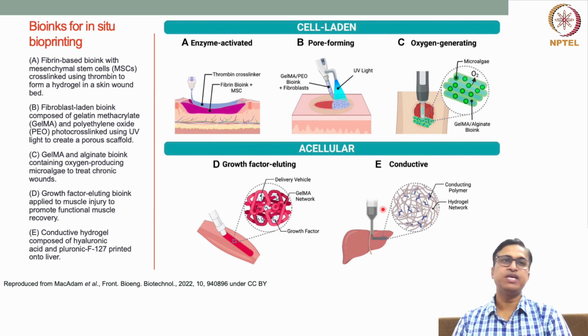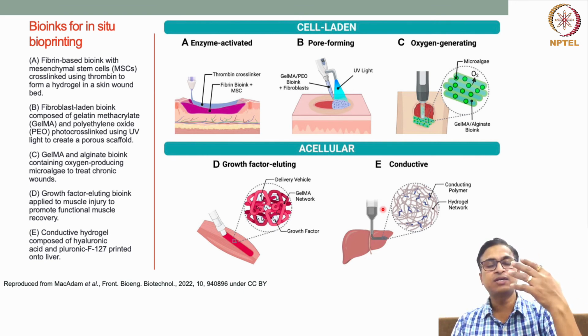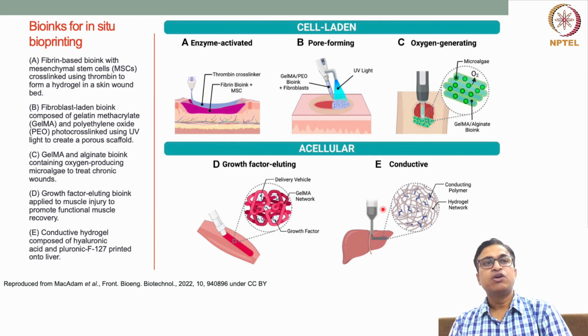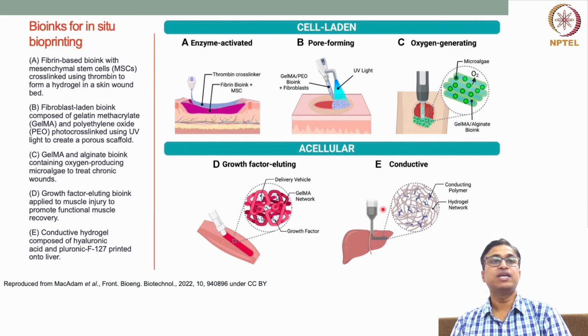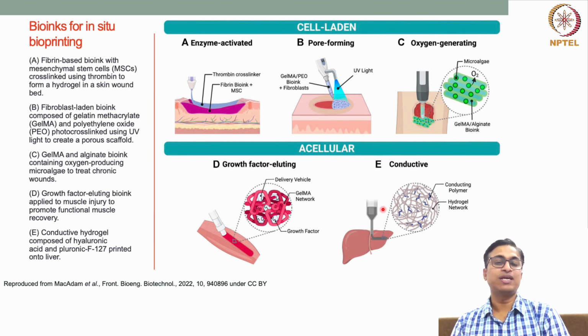We can adjust the pH by maintaining the temperature below 15 degrees centigrade. At that time collagen will not become insoluble again, which means collagen will not get solidified. But if we increase the temperature of that pH-adjusted solution to 37 degrees, it will become cross-linked. The self-assembly of the collagen will happen, and by this way, we can form different types of structures.